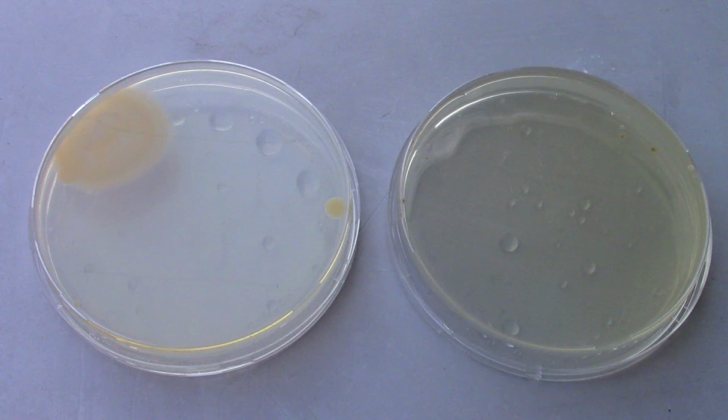So I thought, well, you know what? I'll try them as they are. And in a couple of other ones, I will put some of that purified water in, let the agar soak it up, maybe plump up. Maybe it'll help things grow better. Well, I clearly didn't need help with things growing better, and I never got around to re-swabbing because the agar just didn't soak up the water the way I'd hoped. But I had added the water in these, and then I left them outside, honestly. And I thought it was interesting that even though I didn't swab anything in them, they started to grow something.